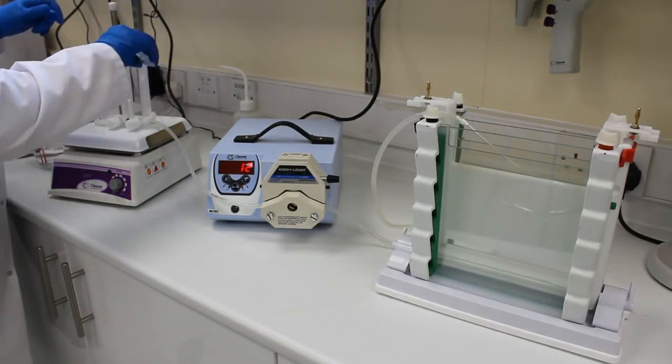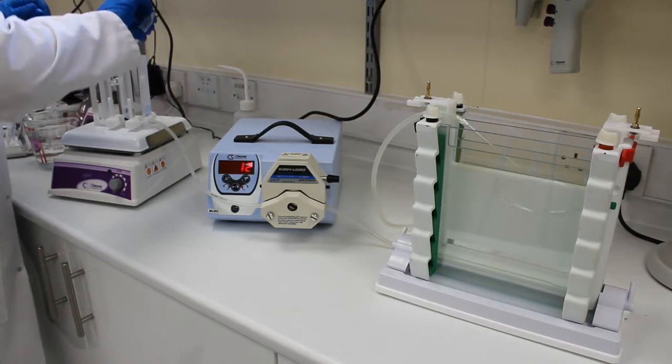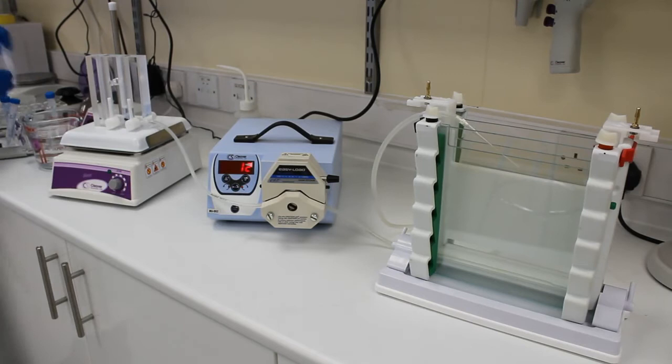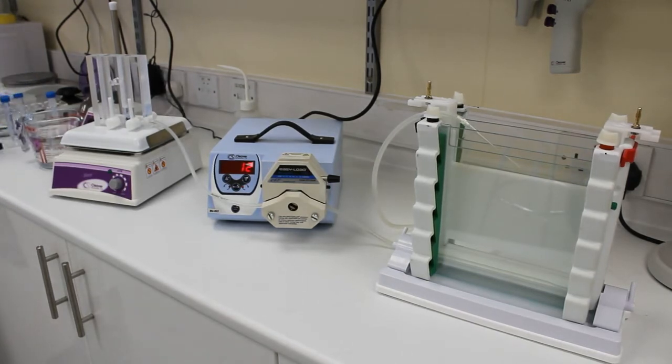So we've got our first solution going into the first well of the gradient mixer. I'm going to turn on that magnetic stirrer. So this is the high denaturing solution and we've also got an amount of DNA dye in there which is going to indicate the gradient of the gel once it's been poured.